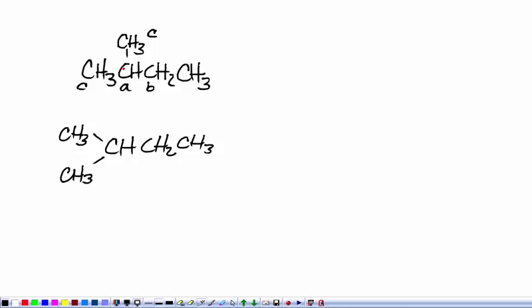I mean, okay, this requires that you can name IUPAC named compounds. But at this point, that's the least of your worries in terms of lecture. That starts being less important once we get to things like reactions, reagents, and mechanisms. But these are alkanes. Okay, so in this case I got 4. So that was the correct answer, was 4. If you said 5, you thought the 2 methyl groups were not equivalent. If you said 6, don't know what you're thinking. Okay. All right.